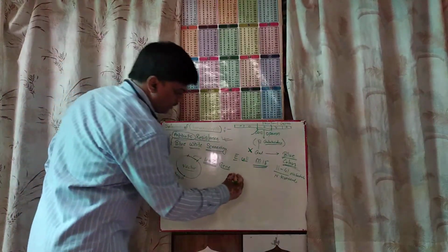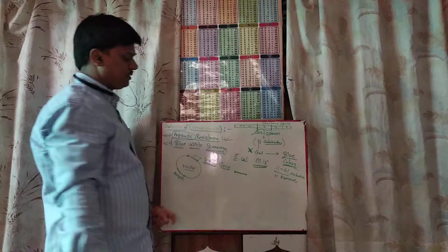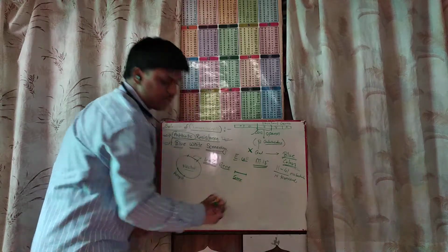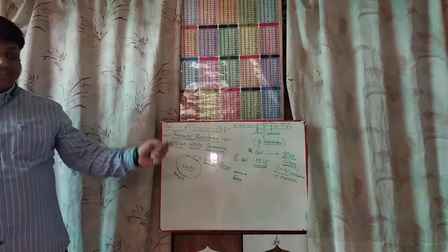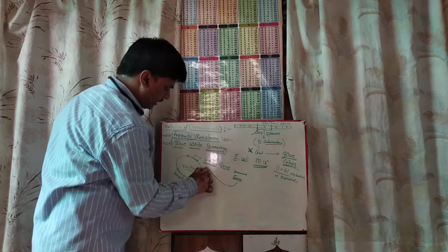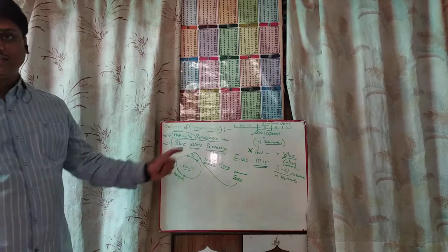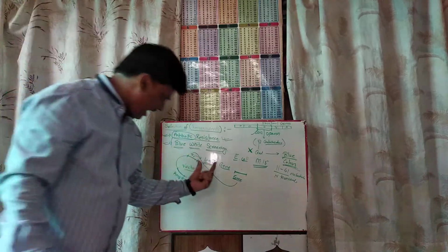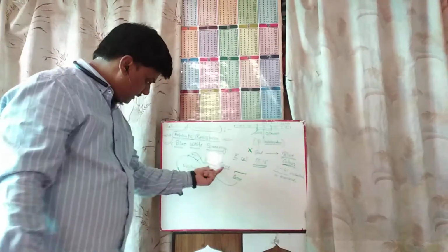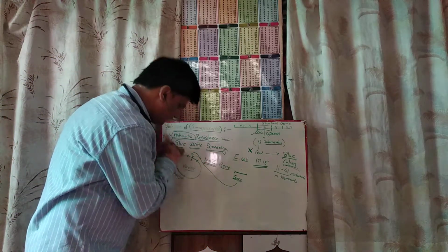Suppose we have this gene which is our gene of interest. This gene of interest gets inserted into this, that is inside the lac Z gene. Why do we take this? Because you all know that these genes have restriction sites.